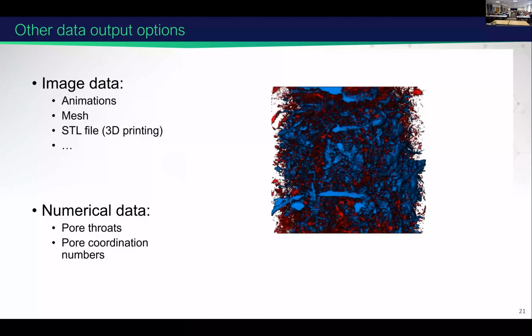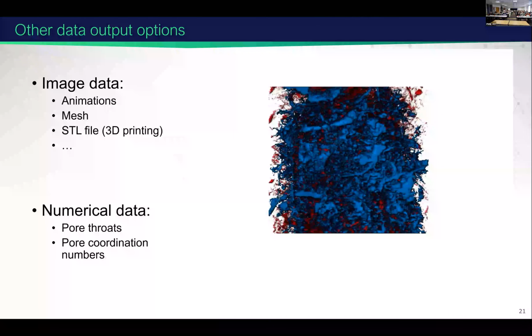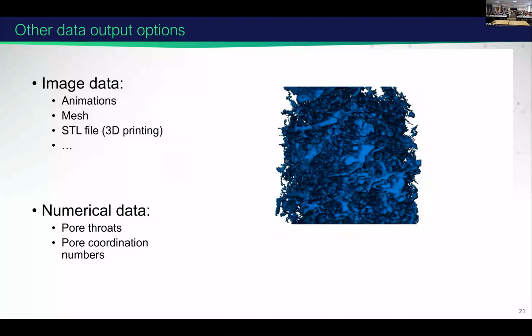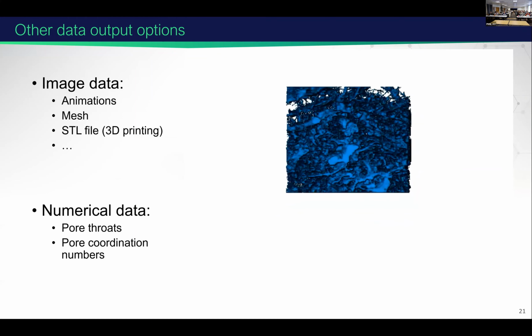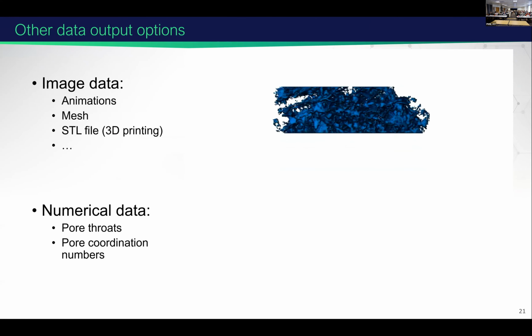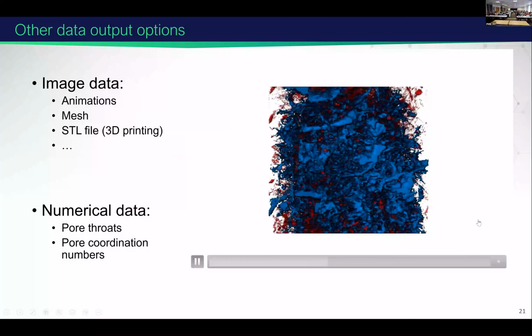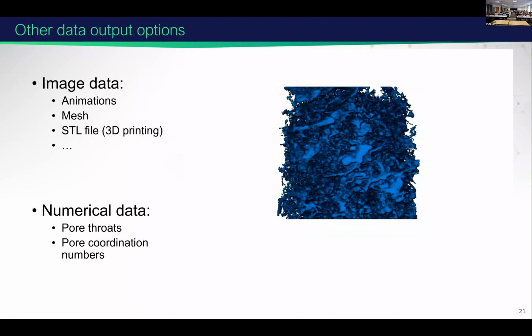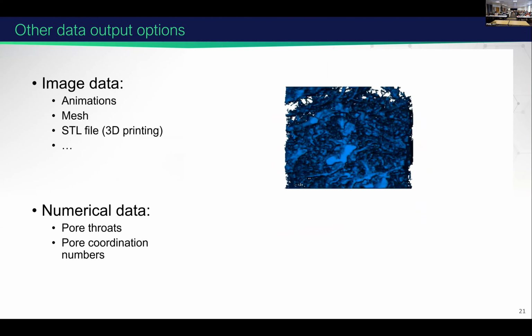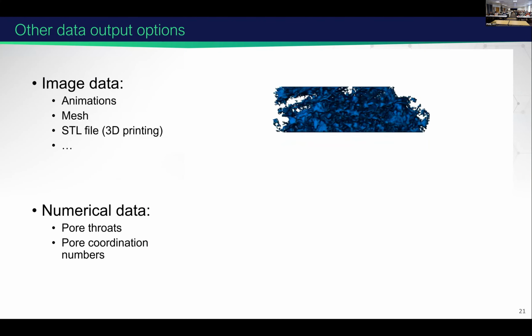Yeah, other data that we can provide from CT are these beautiful animations created by Anil. Maybe I'll go back a little bit. The isolated pores are in red, the connected pore space is in blue, and they can be visualized separately as well.